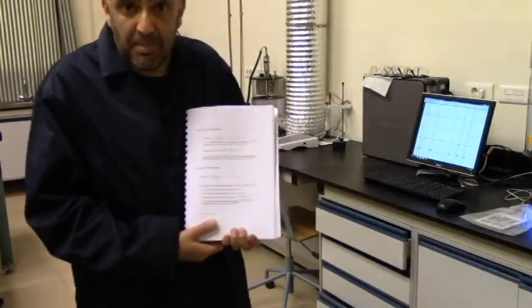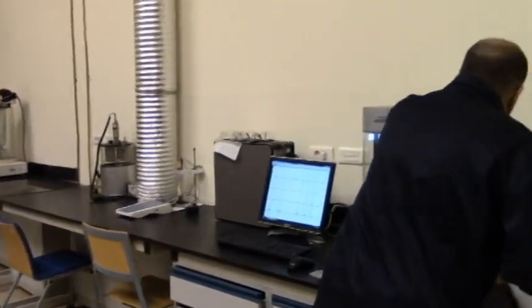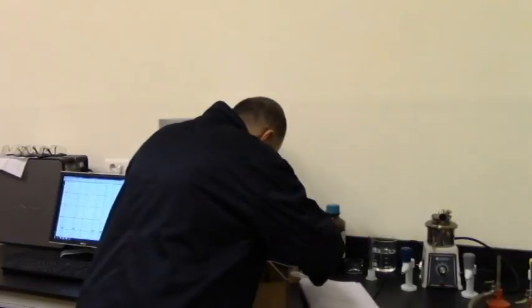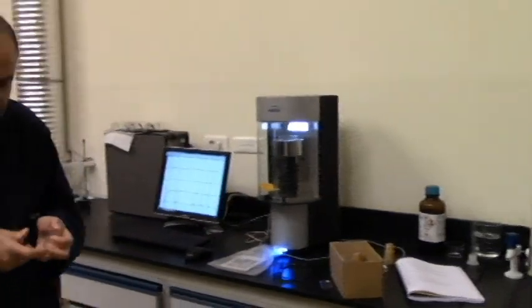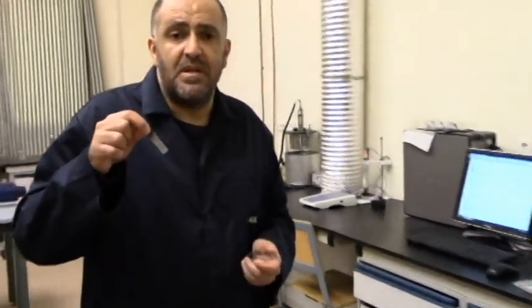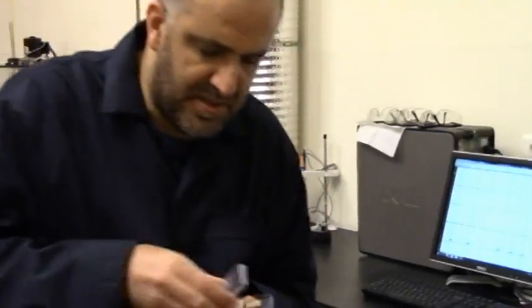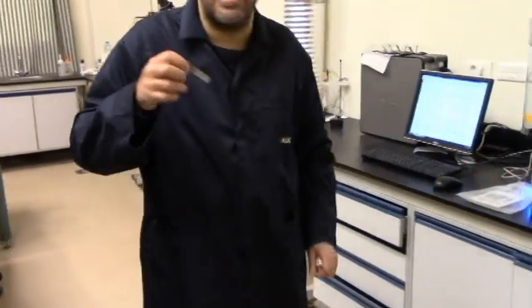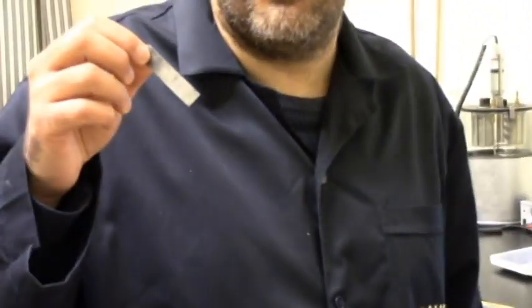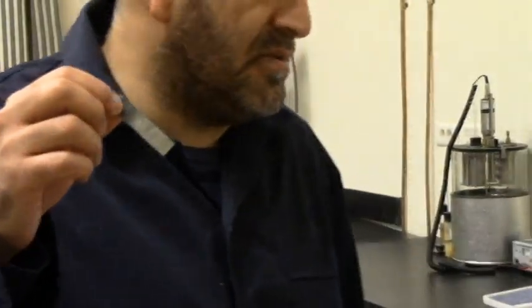So our solid sample actually will be this zinc strip. Actually, the solid sample will be my piece of rock, which is cut like this one, like any of these. But for our case, I'm demonstrating the idea using this zinc strip because it is non-porous, so it does not imbibe water. It is easier for cleaning and for dealing with it. It's more robust, it cannot break easily.